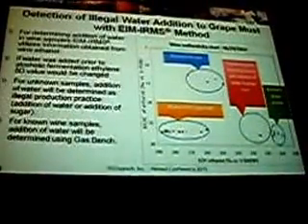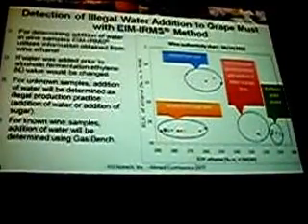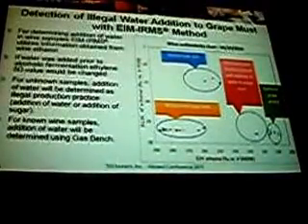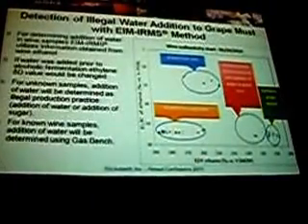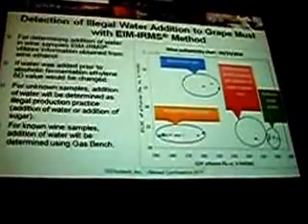And if we have information for a specific wine in our isotopic wine data bank, then we will compare ethanol delta D values with oxygen delta values, and we will determine if sugar or water is added, or both.